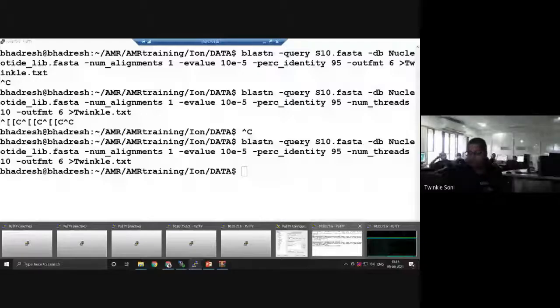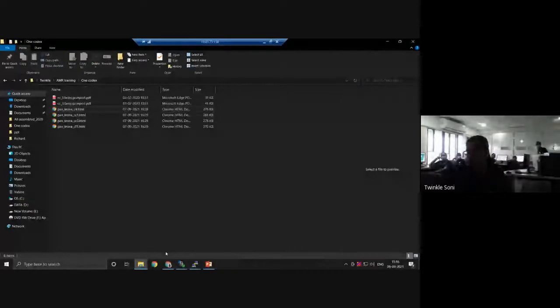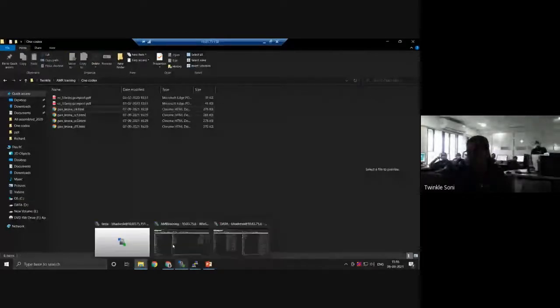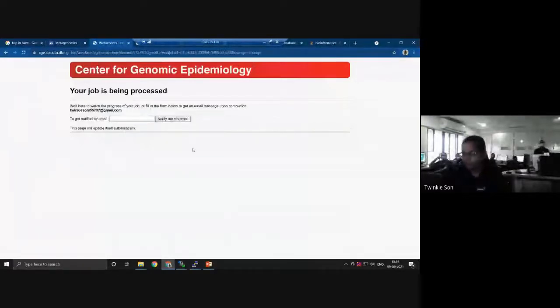Did you see? Okay, our blast has been completed. Anyways, let's wait for this result first. Okay, let it be. I just added my mail ID over here, so it will send a notification.